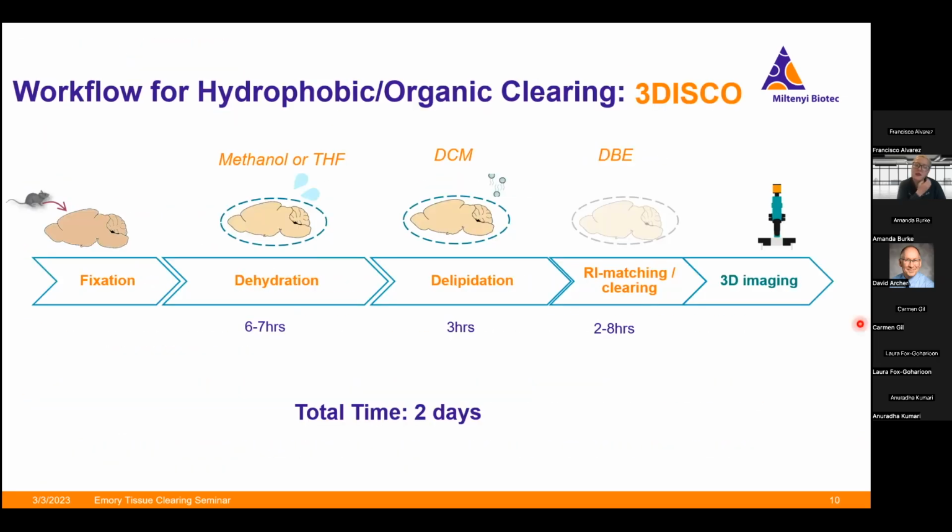And for all of these times, as you can see, the dehydration is pretty spot on. But when it comes to the clearing portion, there's a big range in time. And this is really just dependent on the size of your sample. This will be a common theme throughout my talk, because a lot in terms of the timeline of clearing and staining will depend on your sample size.